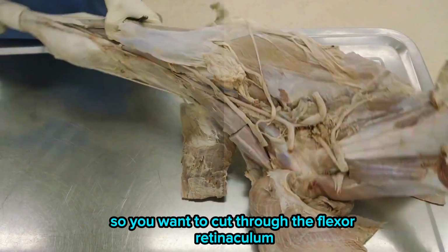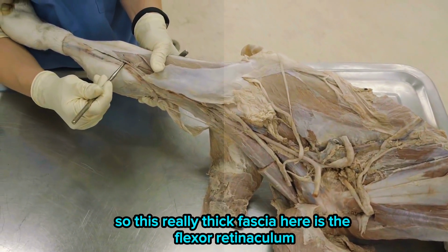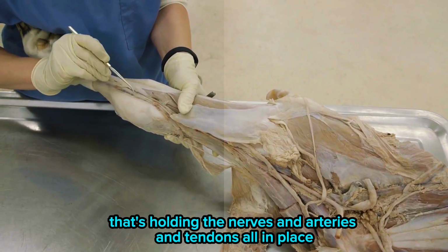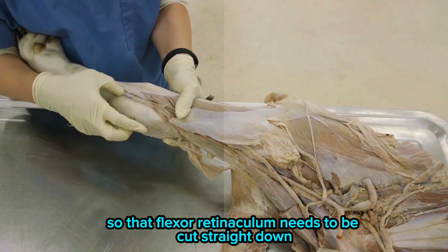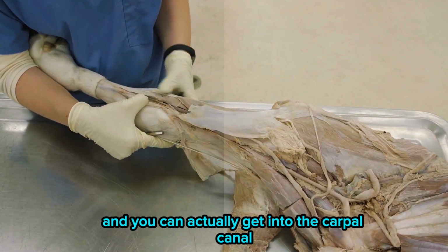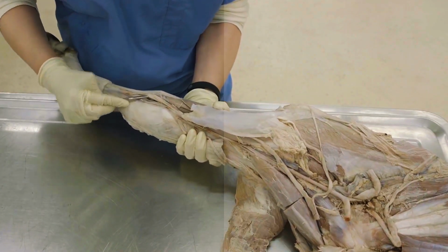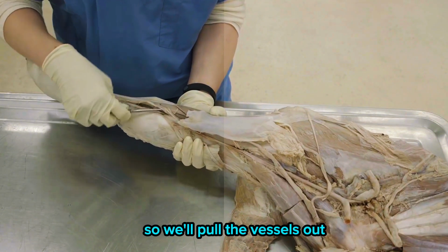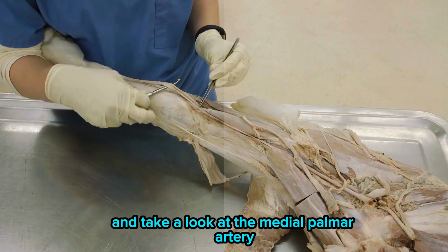So you want to cut through the flexor retinaculum. This really thick fascia here is the flexor retinaculum that's holding the nerves and arteries and tendons all in place. That flexor retinaculum needs to be cut straight down, and then you open this up and you can actually get into the carpal canal. So here, if we try and pull those vessels out, those are inside the carpal canal. My finger is in the carpal canal. We'll pull the vessels out and take a look at the medial palmar artery.